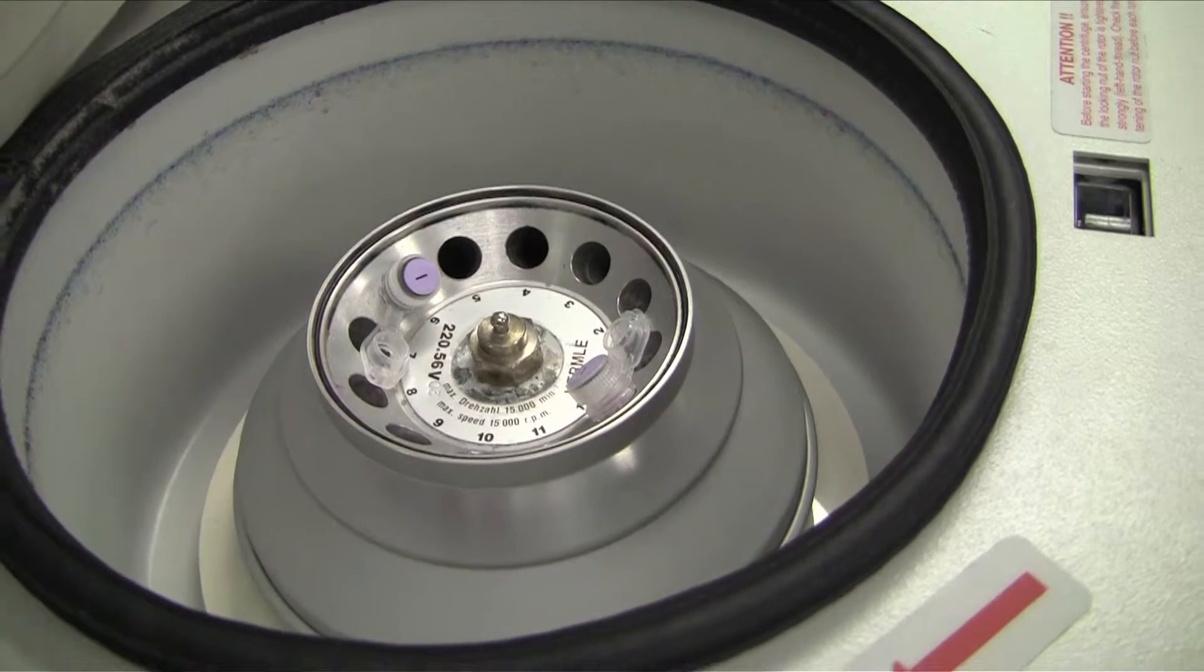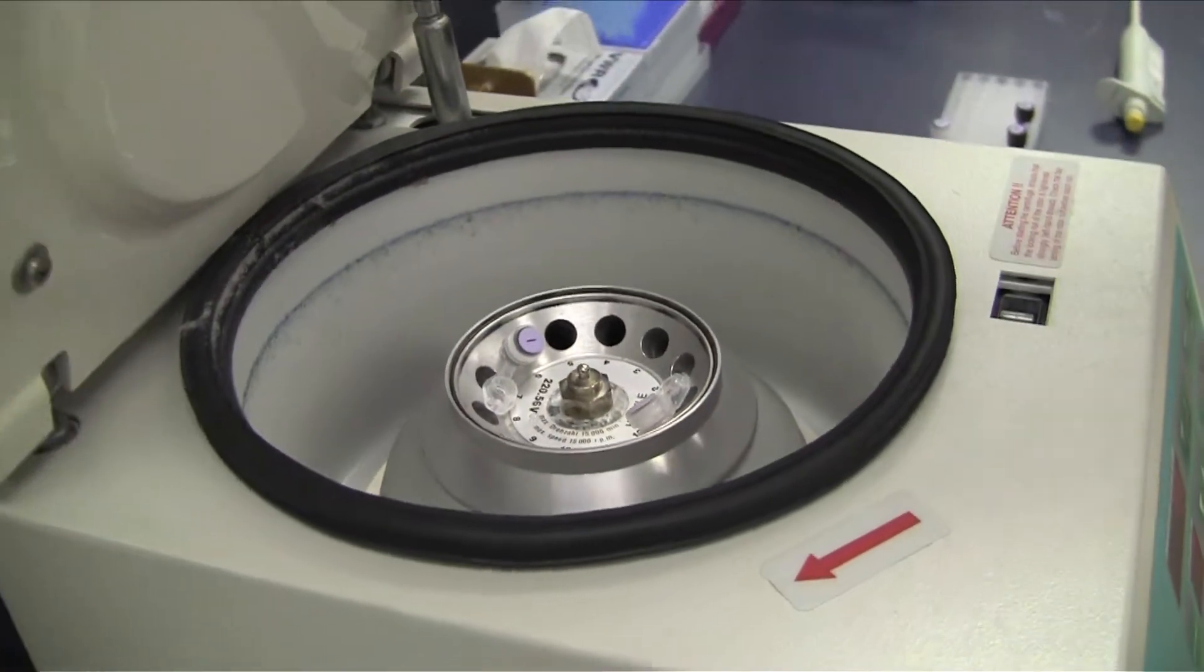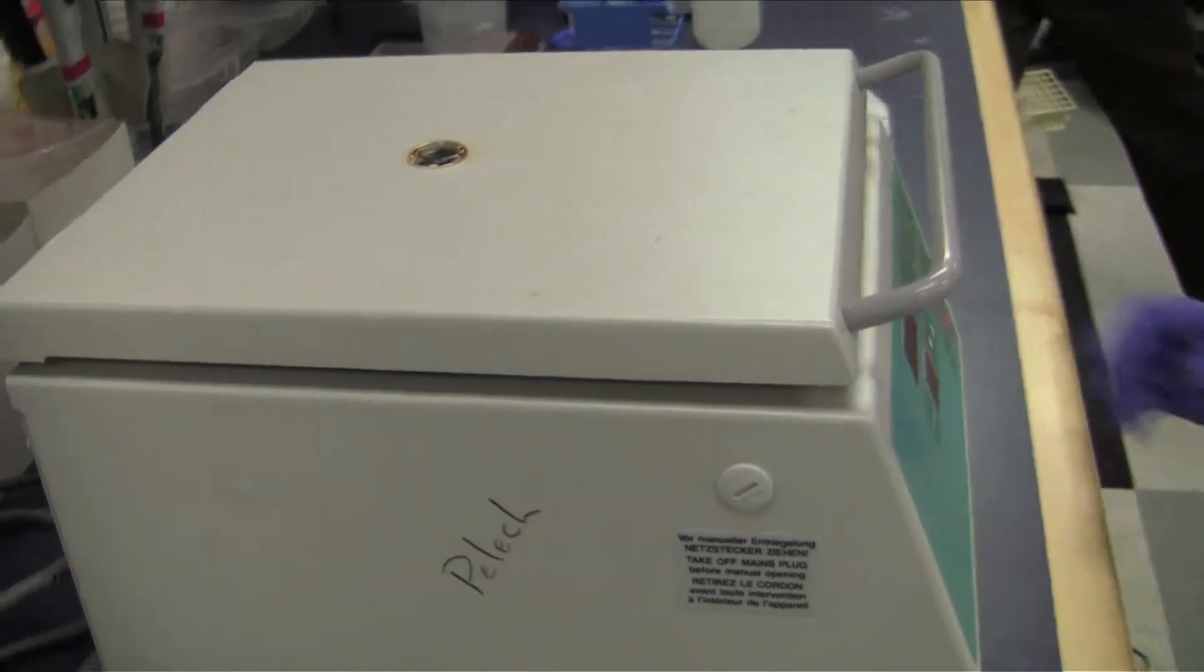Centrifuge for 2 minutes at 750 times G and recover the purified labeled sample from the bottom of the collection tube.